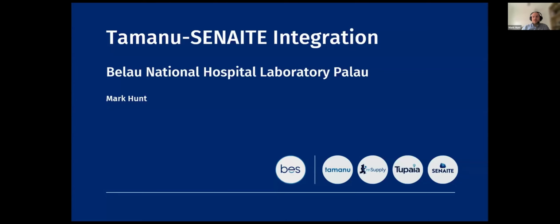So today I'm going to talk about the Tamanu and SENAITE integration, which we went live with in the Palau National Hospital laboratory about 2 months ago, and it's been a great success.